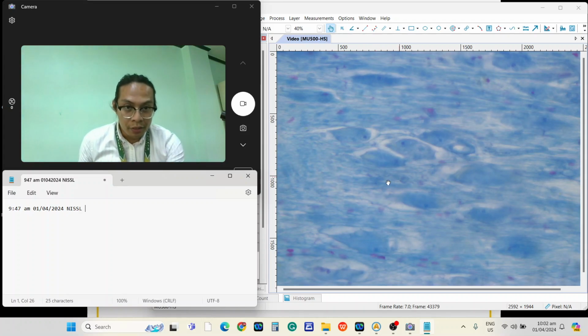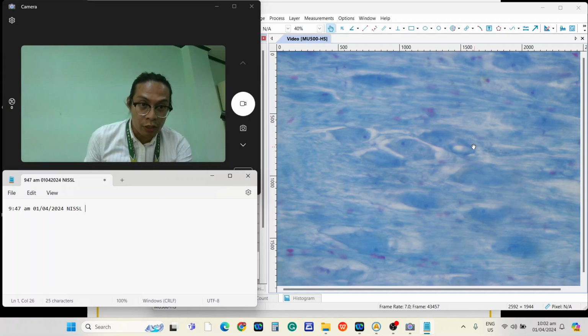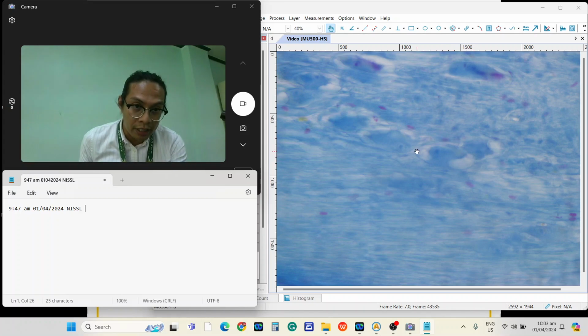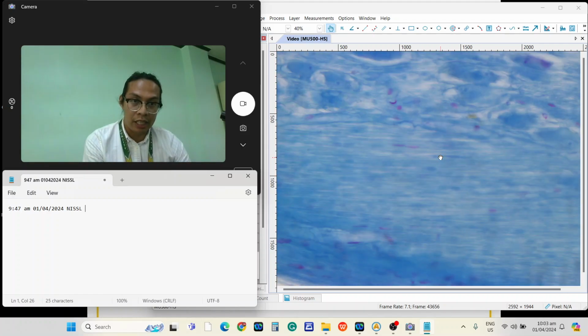So those are neurons, diba? Again, meron siyang soma, and those are their fibers. Those fibers are actually covered with this type of cell, that is a Schwann cell. May nakita pa ako dito kaninang mas magandang structure. Another Schwann cell. Now, Schwann cell usually does not stain kasi yung sinisecrete niyang substance, which is the myelin, hindi siya nag-stain. Ang nakikita na lang natin is the neurokeratin that is left of the Schwann cell.